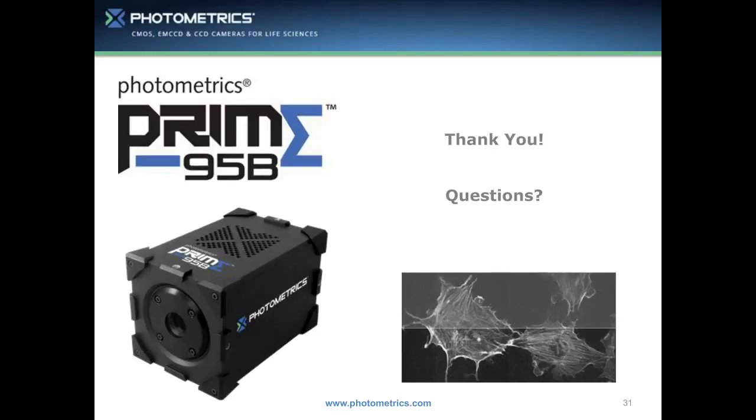Can the denoising algorithms be used on EMCCDs? Yes, the denoising algorithms can be used on EMCCDs. One of the limiting factors actually is the number of pixels on a sensor. Because we're looking for structure and similarity in an image, the less spatial information there is, the less you're able to reduce the noise. But there are implementations that can use 3D image stacks to minimize that noise on EMCCDs. Now, you're not necessarily removing the excess noise from the measurements, but you are reducing the effects of the noise in the image.